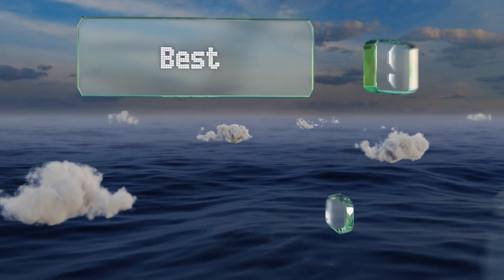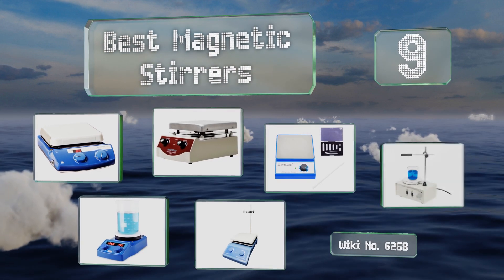EasyVid presents the nine best magnetic stirrers. Let's get started with the list.